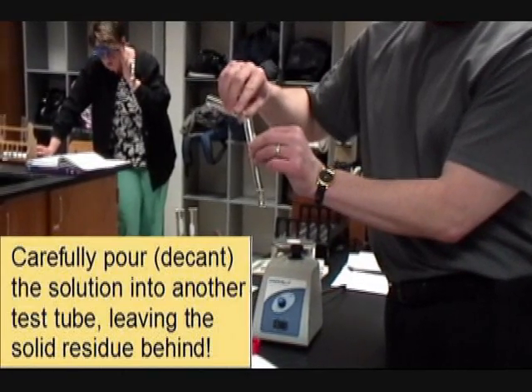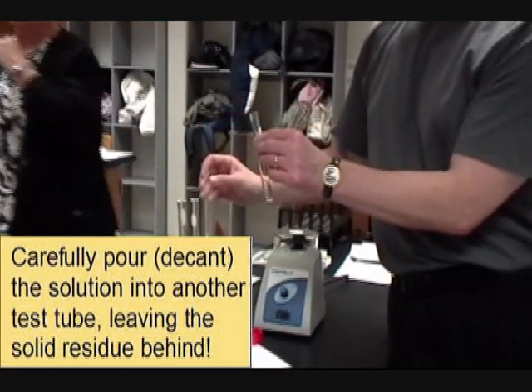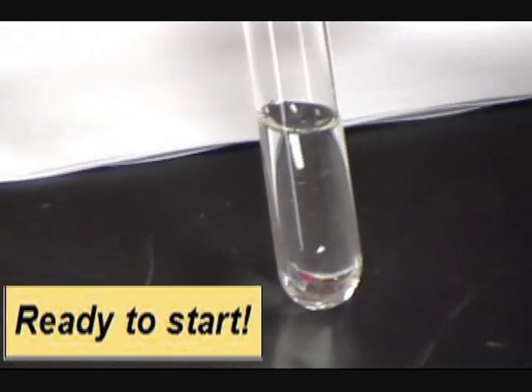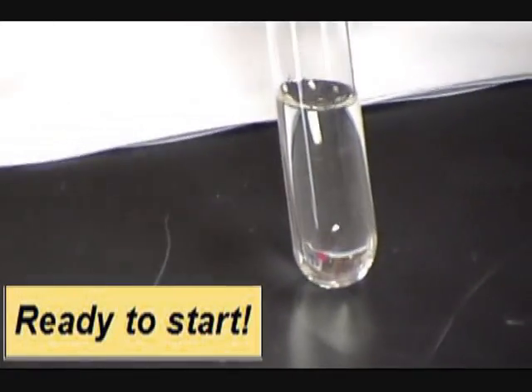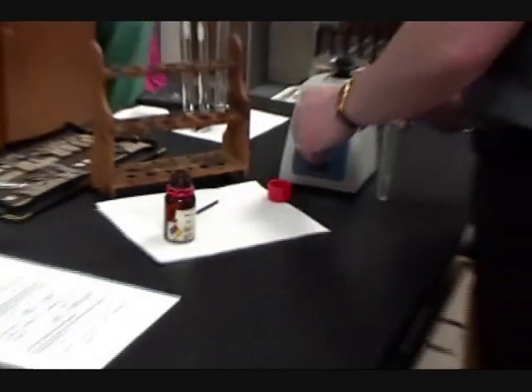I know, that's Dr. Elliott? Solid still in there. Okay. We need it again. This is the 6M solution. It's saturated. Okay. How about we add another one in here, that one 12M HCl? No, doesn't quite work.